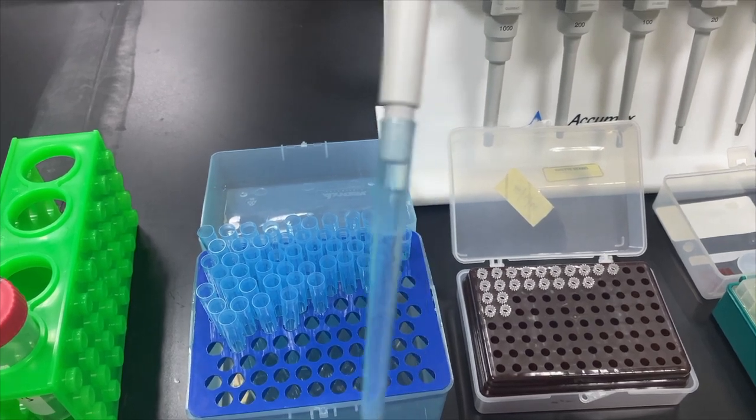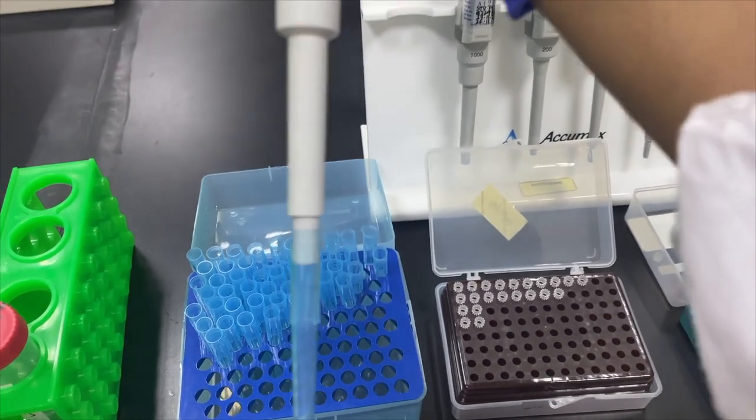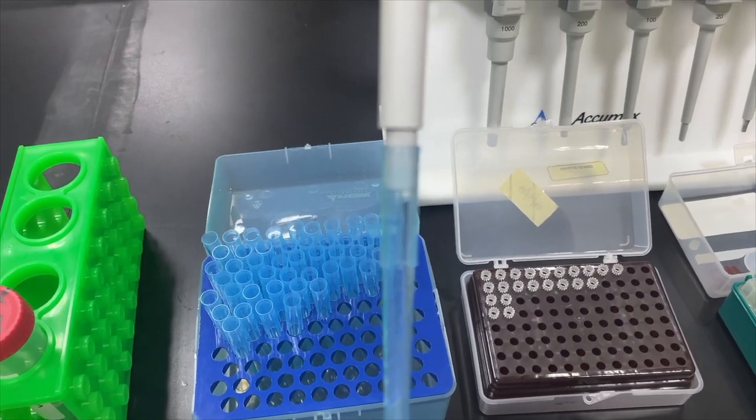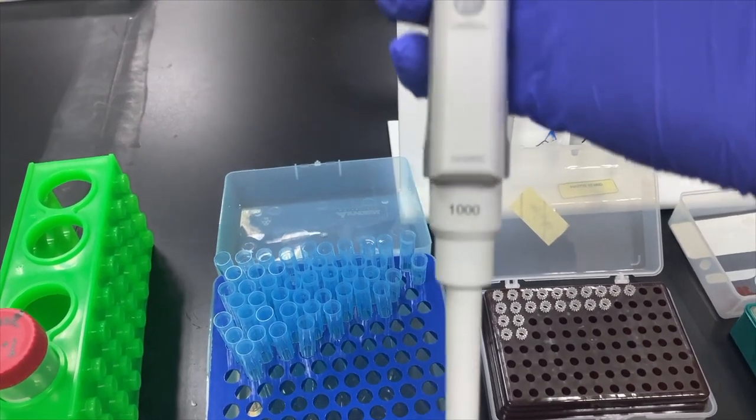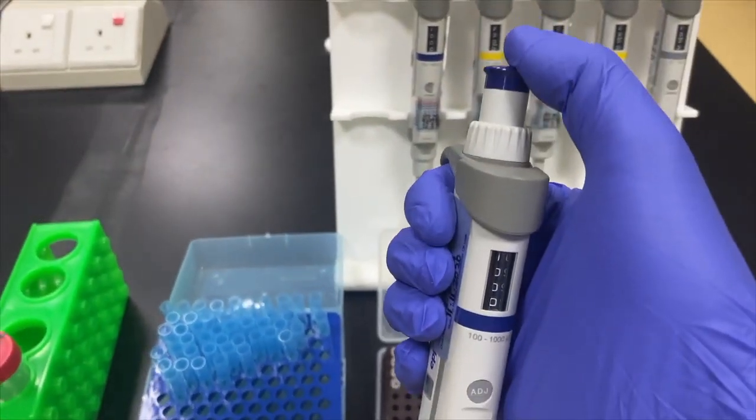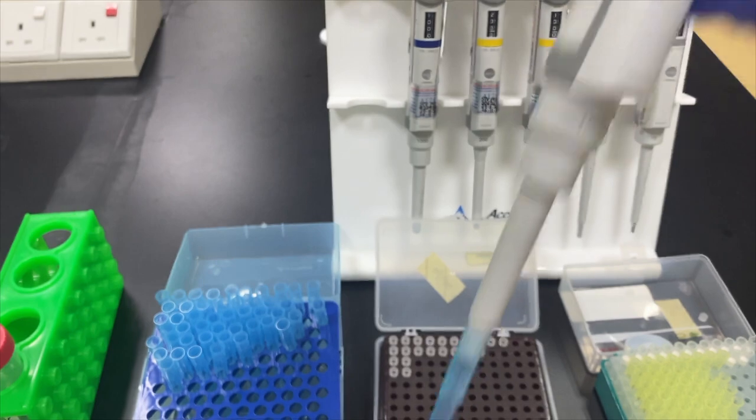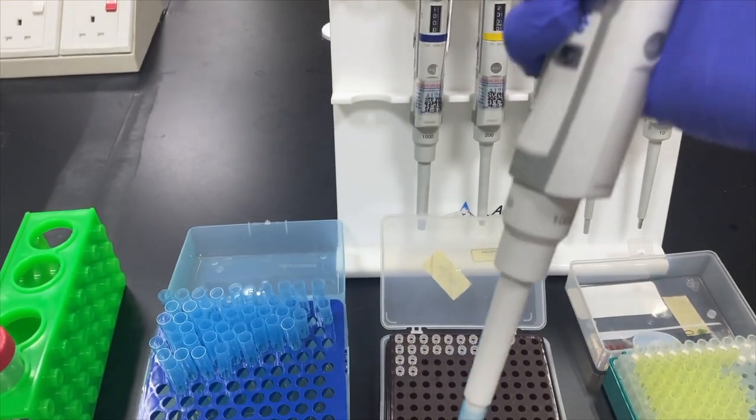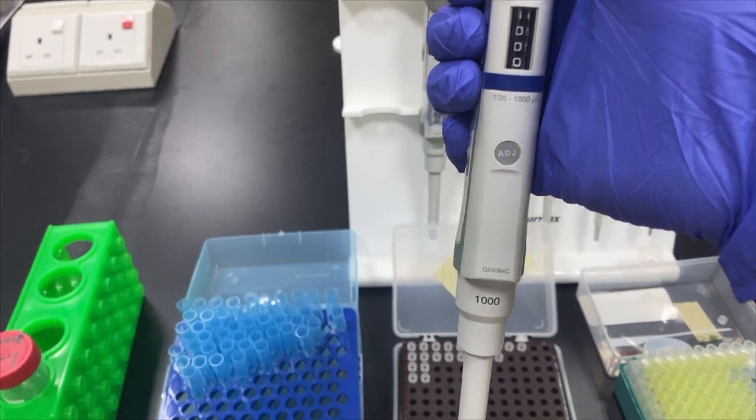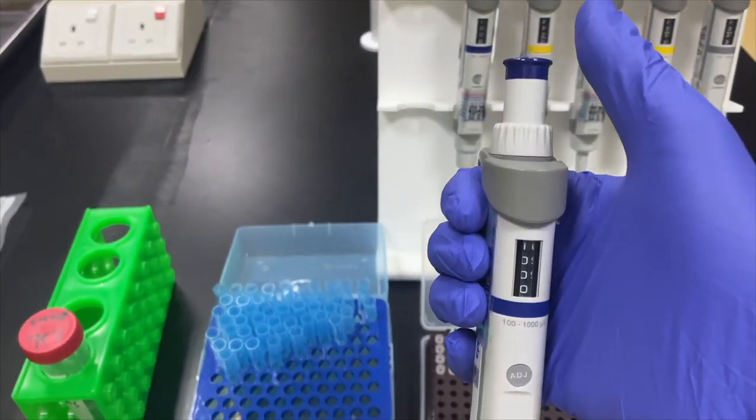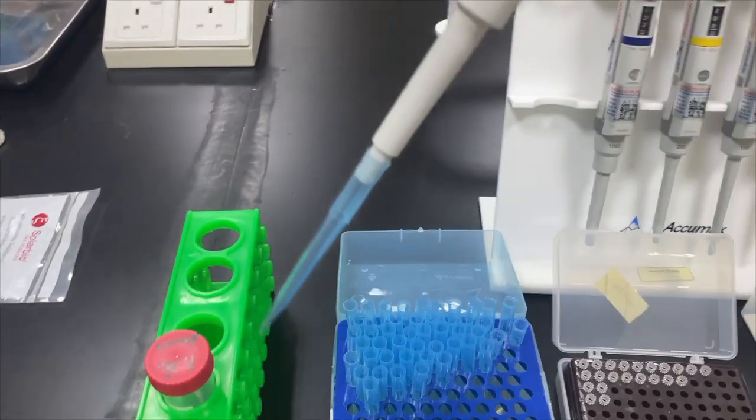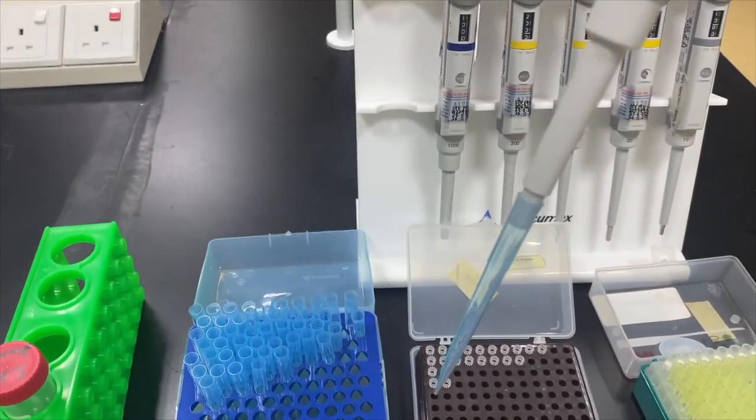So, this is the typical type of tips that attach to the micropipette. How to use it, you press first before putting the tips into the liquid that you want to take. Because if you didn't press it and then you put the tip into the liquid, it will create a bubble.